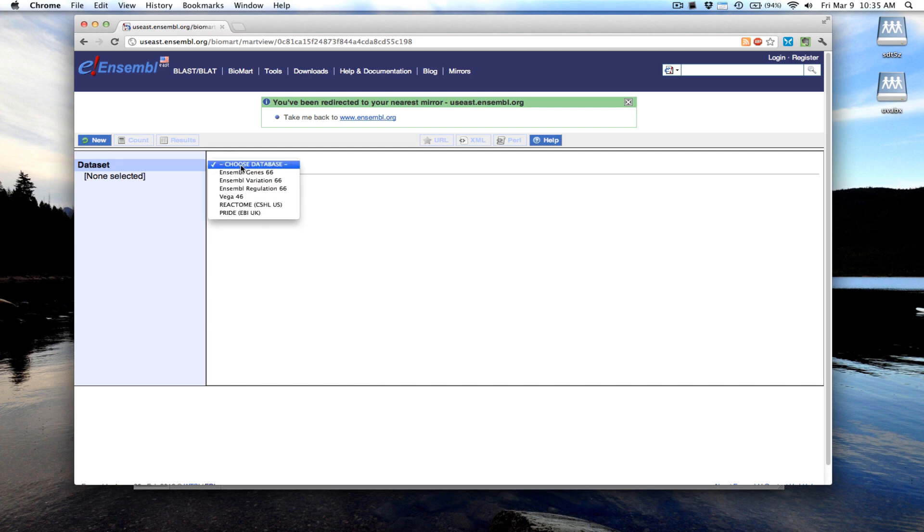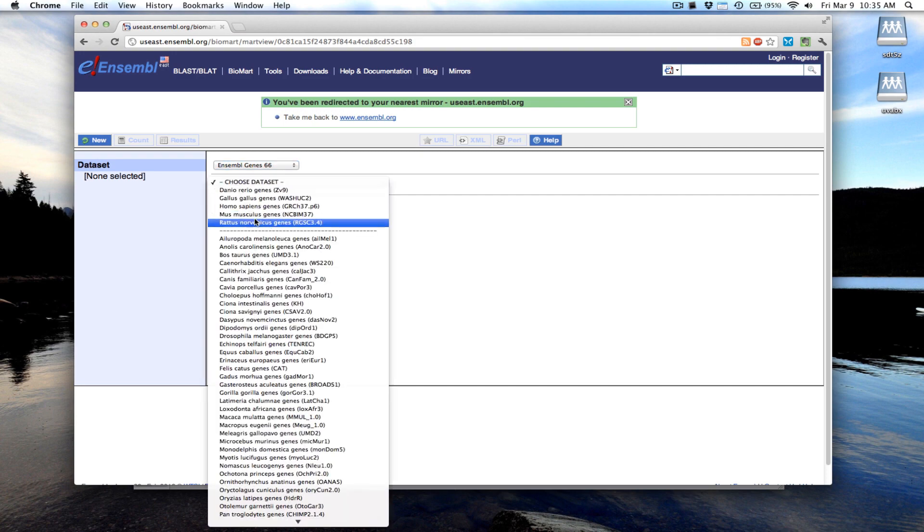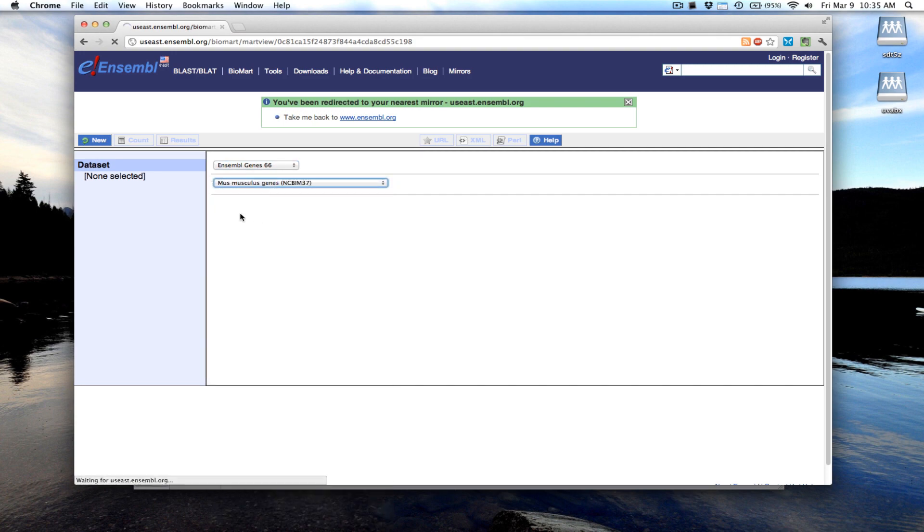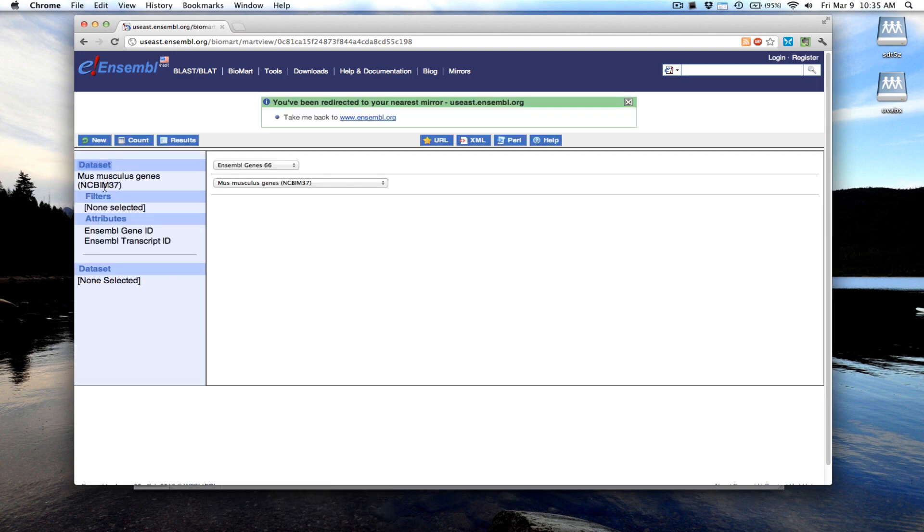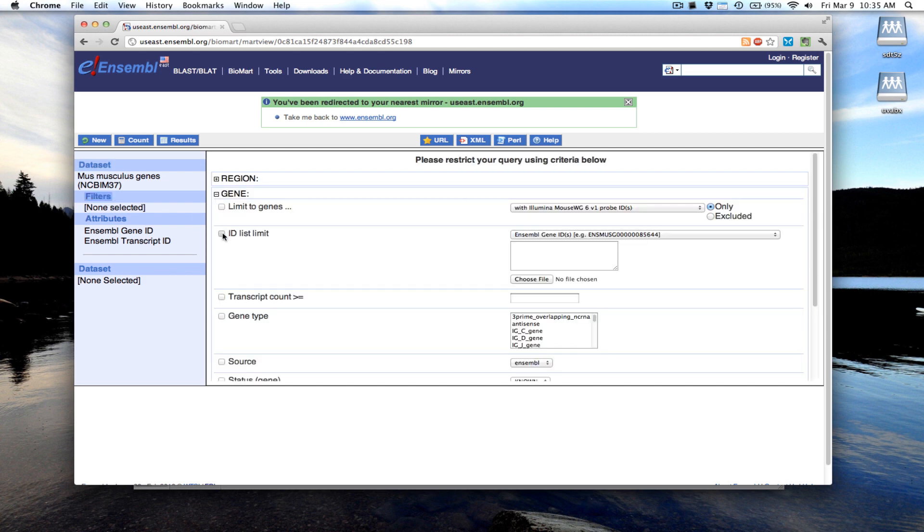In this example, we're using Ensemble Genes data set for mouse, and we're going to filter this data set by gene IDs.